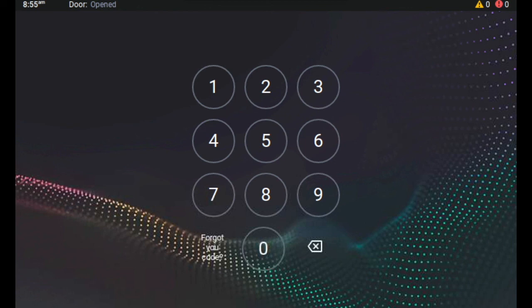You can just block this screen, and only users registered for this company have a unique ID and can log into the master application and do something, create new sessions or control different sessions, etc.